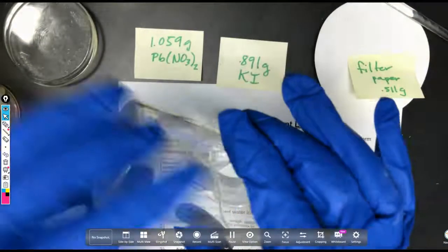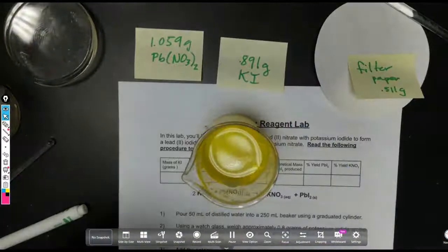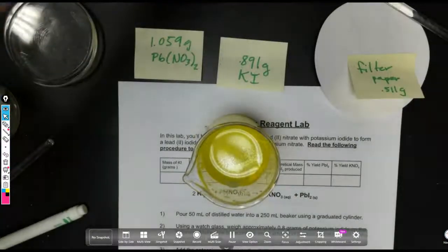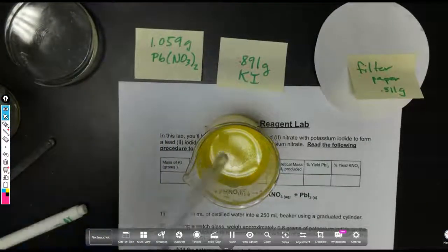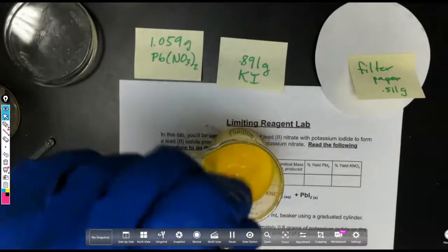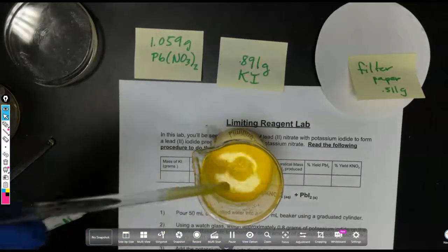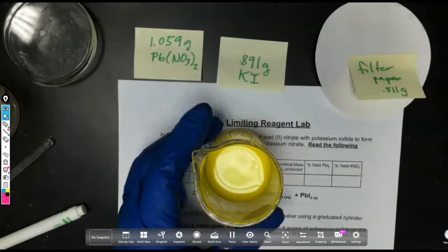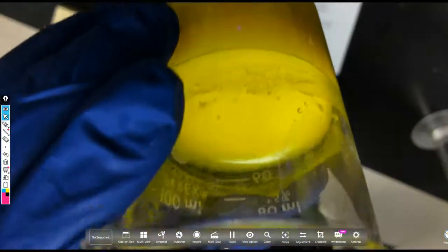And so I am going to go ahead and dump all of it in there, and I got to make sure all of it gets in there. You might have already realized that in fact we have made a bright yellow, no longer transparent product. Now, the fact that it is no longer transparent should be telling you that in fact what we have made is a solid. If we were to look at it sideways, and let me see if I can show it to you sideways, you can already see that the product is starting to settle to the bottom of the beaker.